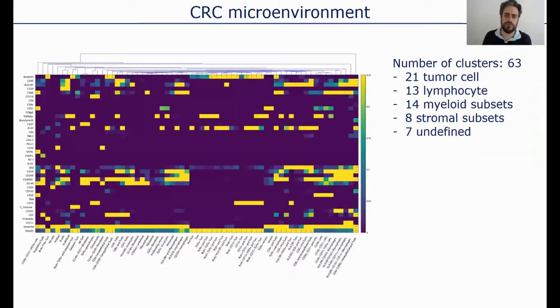We wanted to know whether we could see such transcriptional profiles reflected in the analysis that we conducted with imaging mass cytometry. We processed some samples by this methodology, and through the analysis approach that I explained before, we defined the following clusters, where I confess we adopted a rather conservative approach to avoid defining too many subsets.